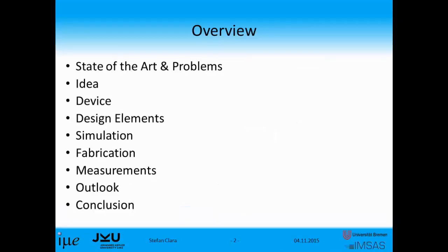First of all, a short overview of my presentation. I will talk about the state of the art and the problems of droplet creation in microfluidic devices. Then about the idea and the device itself. Then we have a look at the single design elements to improve the droplet creation stability. Then we see a short simulation, the fabrication process and measurements, and at the end a short outlook and the conclusion.